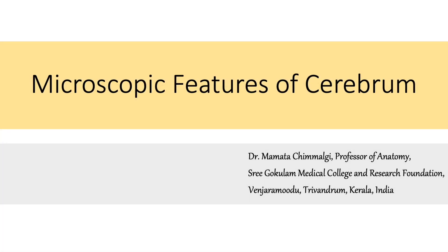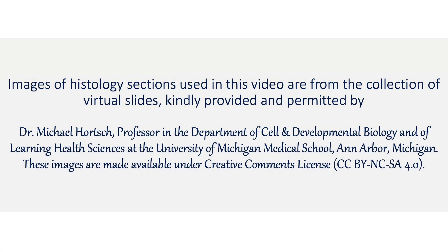Let us now consider the microscopic features of the cerebrum. I am grateful to Professor Michael Horsch of University of Michigan Medical School for providing the images of histology sections.